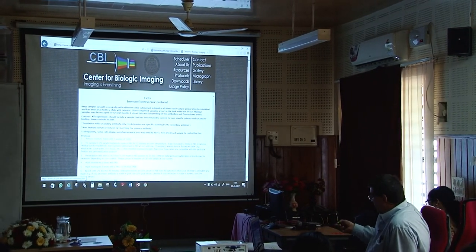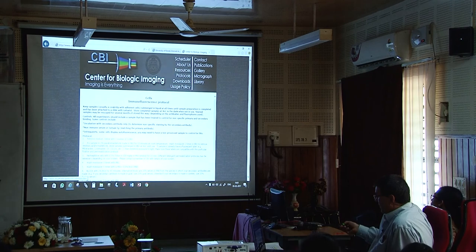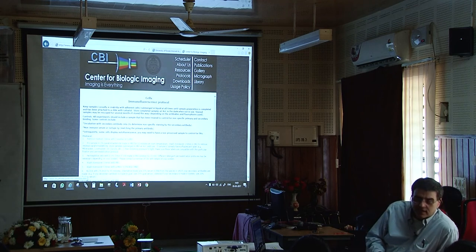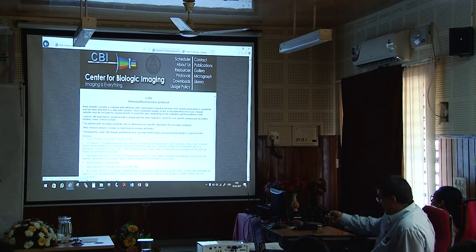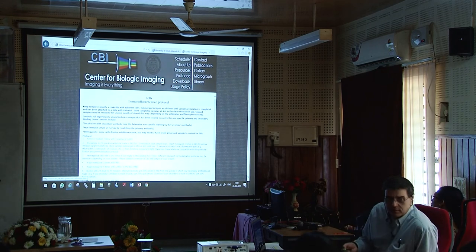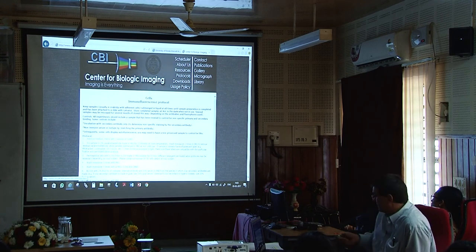Again, he talks a little bit here about the controls, like we talked about yesterday. Secondary antibody only, an isotype IgG control. And then sometimes you need to do a control for the autofluorescence, where you don't do any staining to the cell. You just put it on a microscope and look at the fluorescence. Remember we talked about yesterday how if you do your controls, then you're actually able to interpret your results. Without the controls, you really can't interpret your results. So they are important.